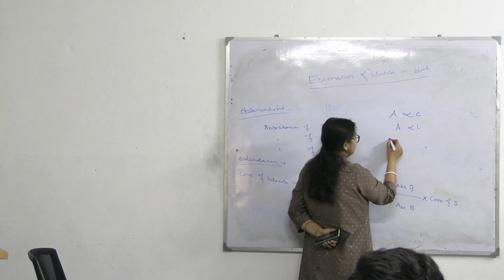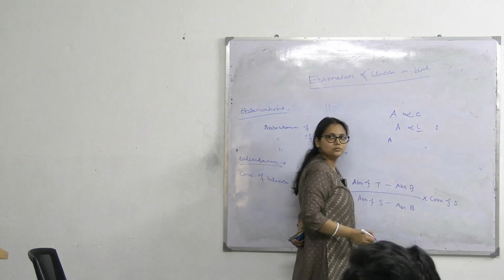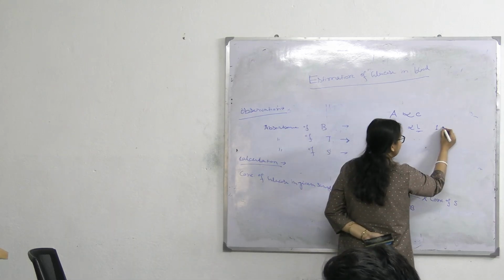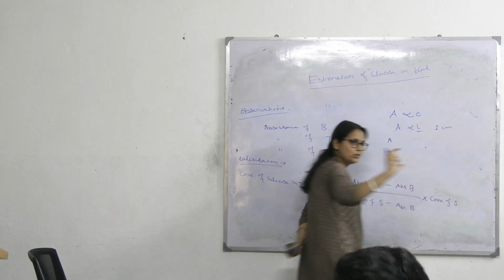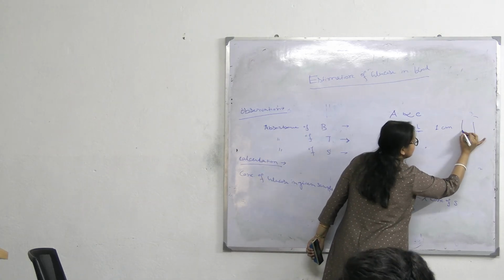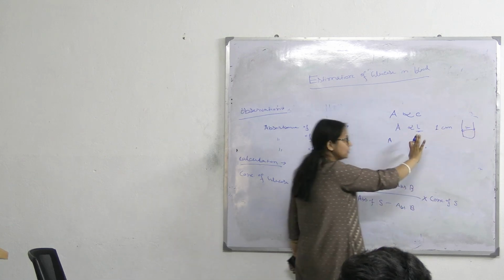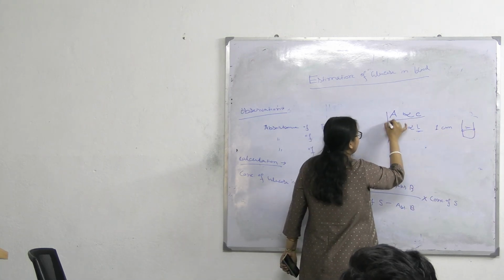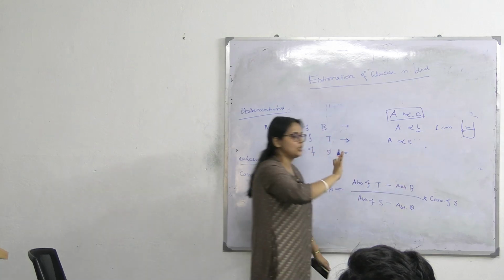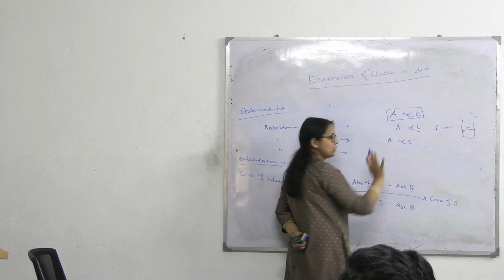Acha, path length is same, that is koto? 1 centimeter, it is fixed. মেশিনের মধ্যে দ্য কুভেটের যেটা লেন্থ, that is 1 centimeter. It is fixed for each measurement. So we are only bothering about A is proportional to C.